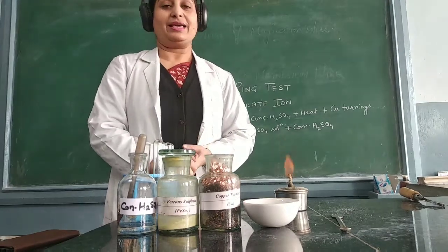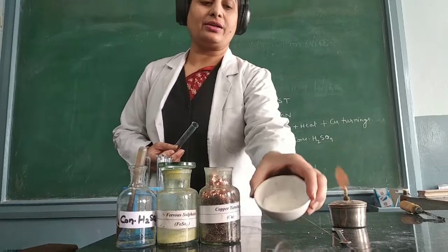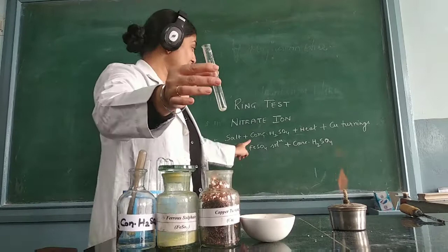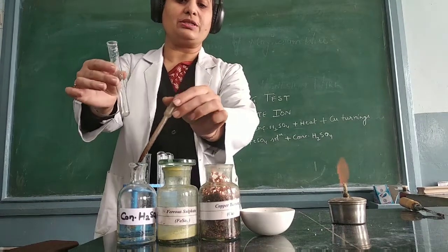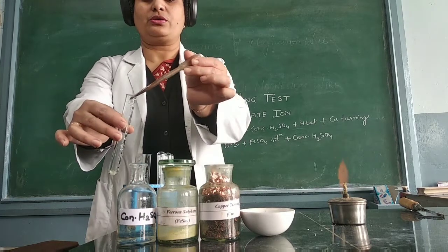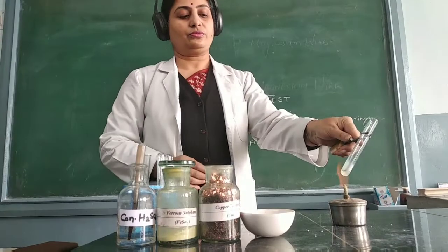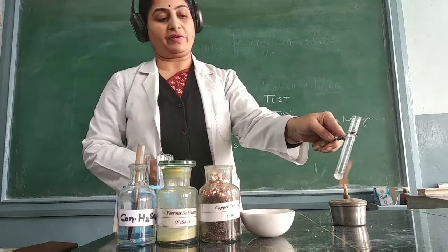The ring test is given by the nitrate ion. Here I am having a salt of this nitrate ion. I take a small amount of this nitrate ion salt in a test tube, and for the preliminary test I add concentrated H₂SO₄ to it — around 6 to 7 drops — and then heat it with the help of a holder over the flame so that it gets dissolved.